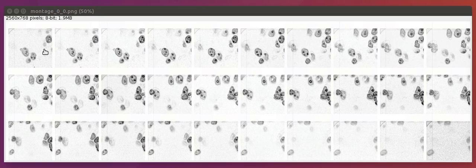So as an example, we can see here, there's already the making of what looks to be a cell, so it's small and dim. Eventually, as we move from left to right, going further up through the three-dimensional data set, we'll see it becomes bigger and brighter, and here, bigger and brighter.